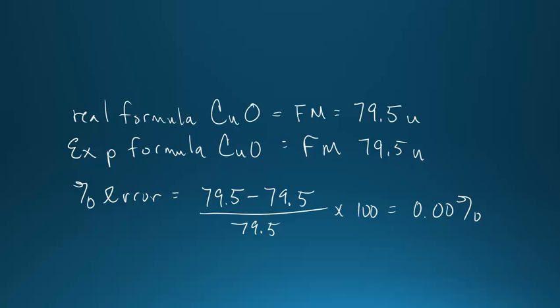I want you to find percentage error. I'll let you know what the percentage error of magnesium oxide, well, you should already know the identity of the actual formula for magnesium oxide, since you know its charges. People back 150 years ago didn't know anything about charges, so this was all brand new to them. They were figuring out charges by doing a bunch of these experiments.